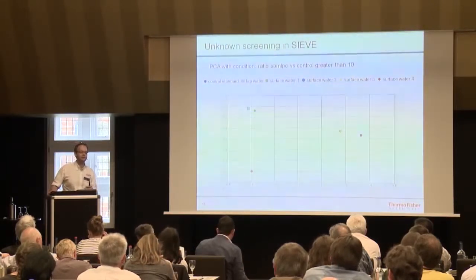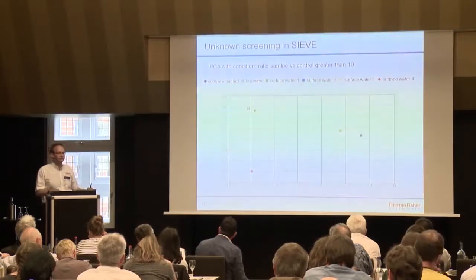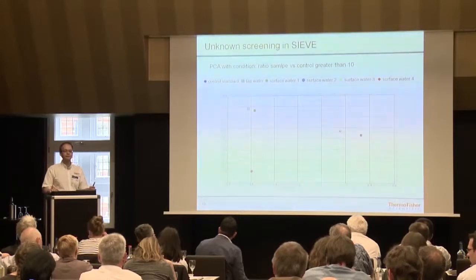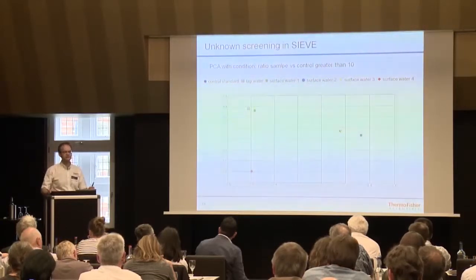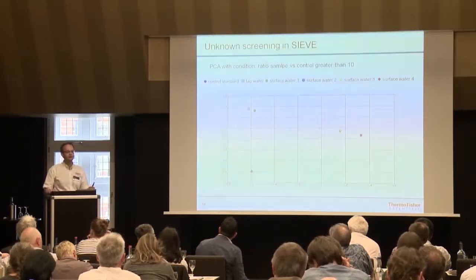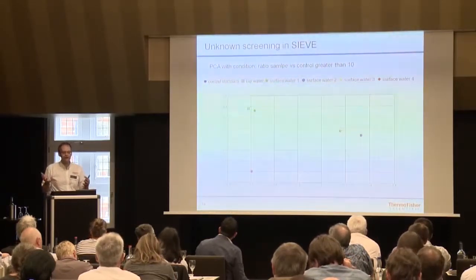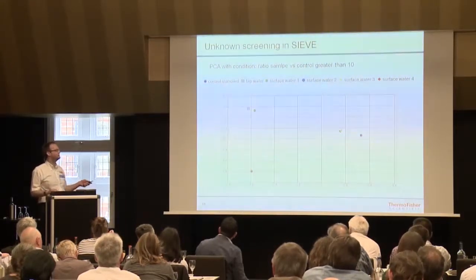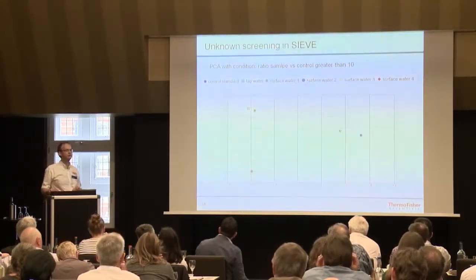If you're thinking about pork meat or something like that, you have samples from the last 2 years or so. You put together, you compare, and all of a sudden one is poking out. And then you can see, oh, did one farmer feed a new antibiotic? Or what's happening here? Or is the meat just bad because it was not cooled properly? Things like that could happen. And that's what such a PCA analysis is really good for.